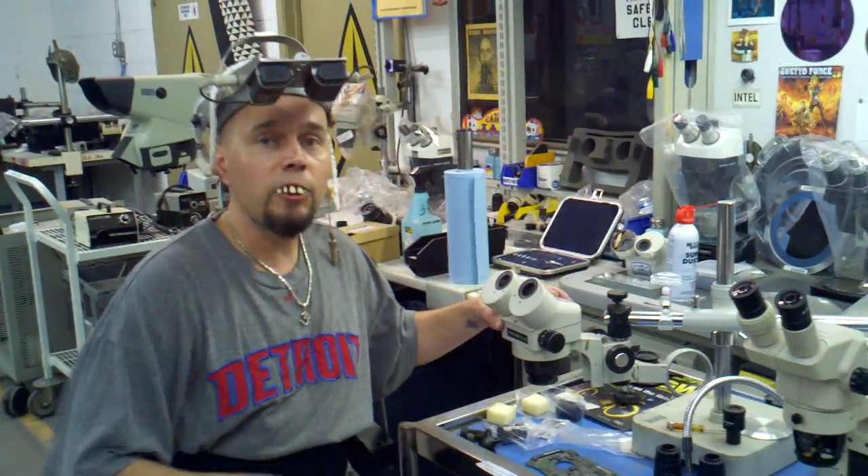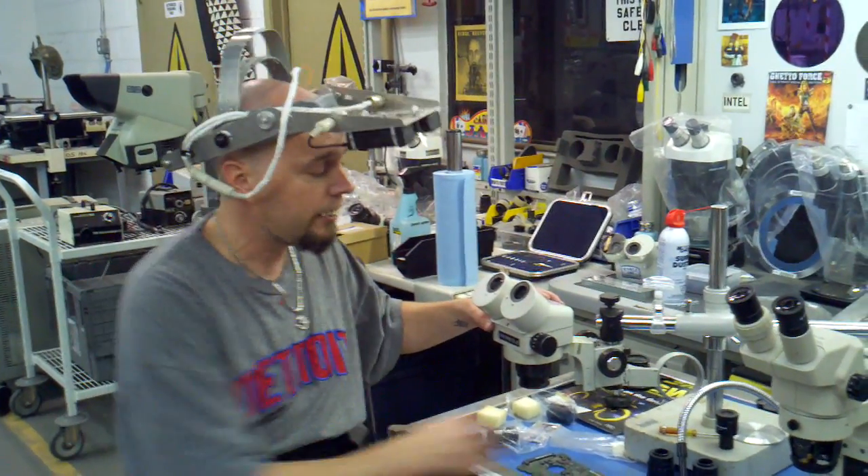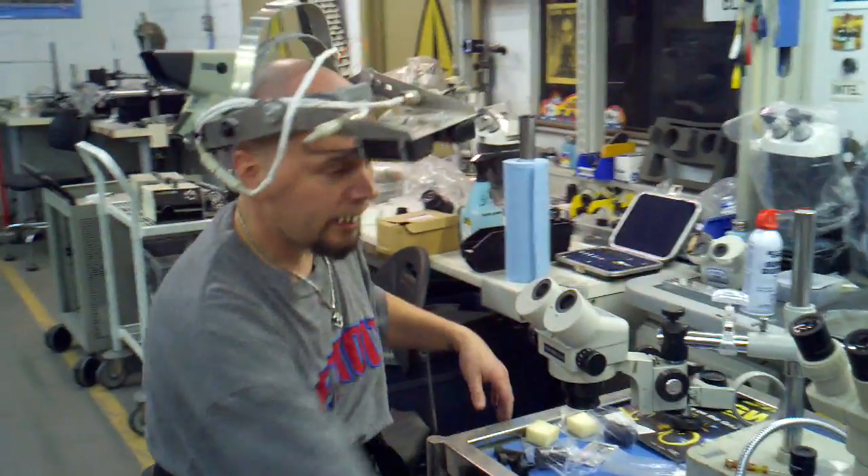So say you have a stereo zoom microscope, but it's all jacked up and you don't know what to do. Well, you strip it down here and you fix the sumbitch.